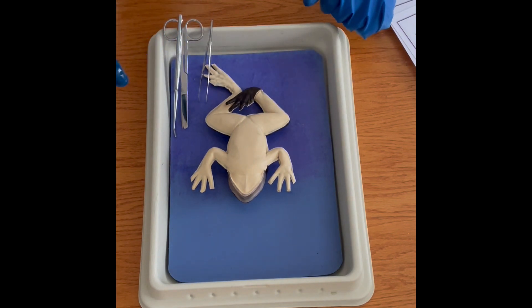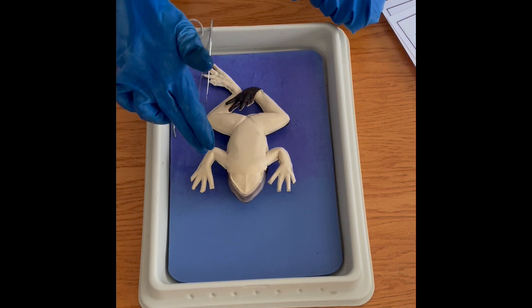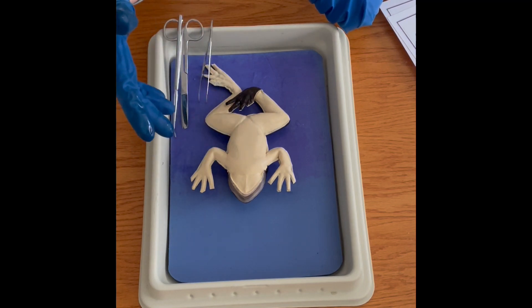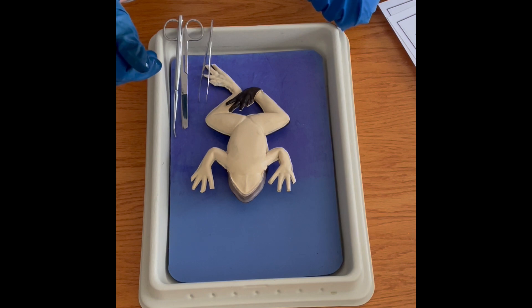The first step in my frog dissection is to find the throat, thorax, and abdomen. Obviously those are easy to see in this model.